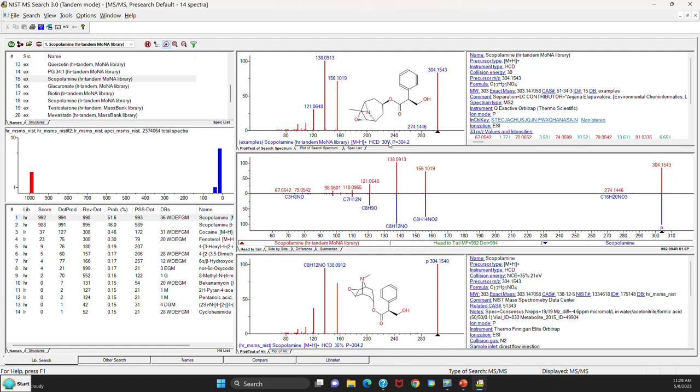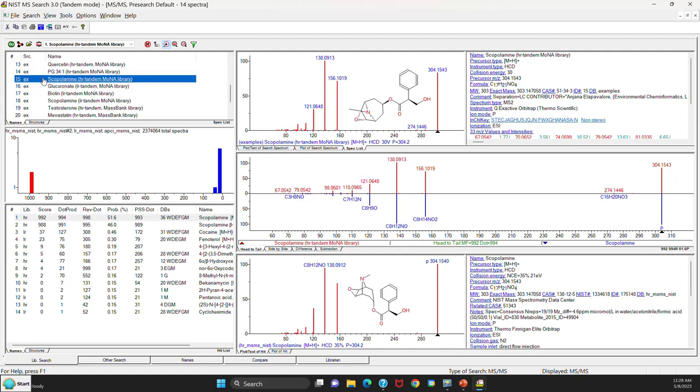So now let's do a search in the version 3 software. You can notice that they've supplied additional spectra than that normally come. They only used to have a few, but now there's a good many here for you to test the software. And I'm going to pick number 15, the example spectra.